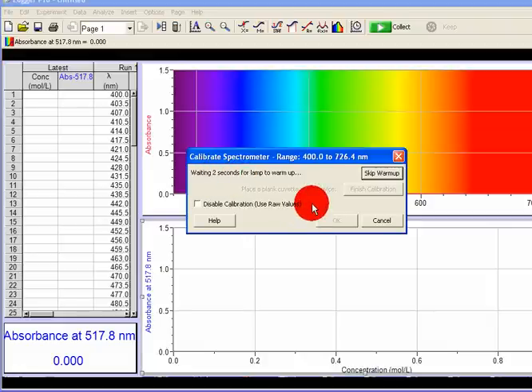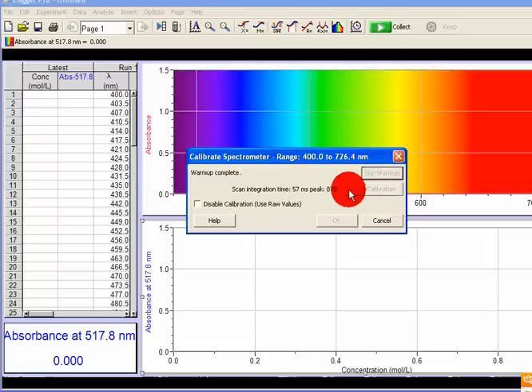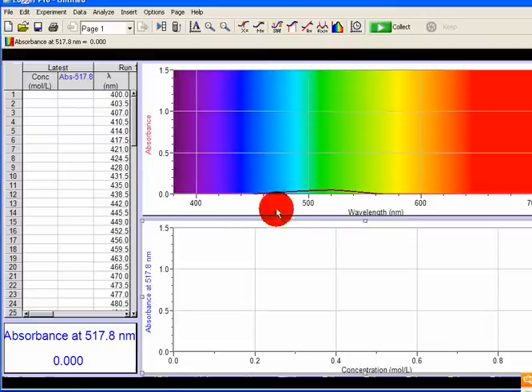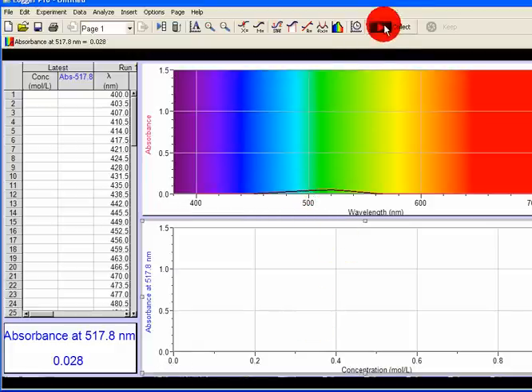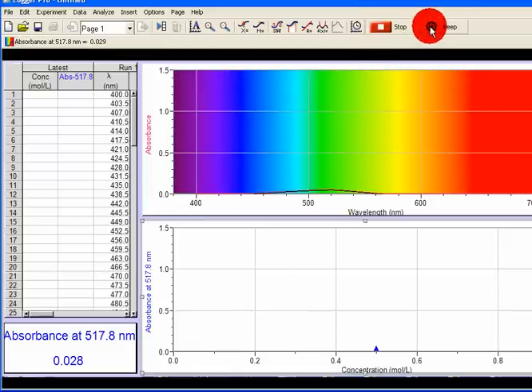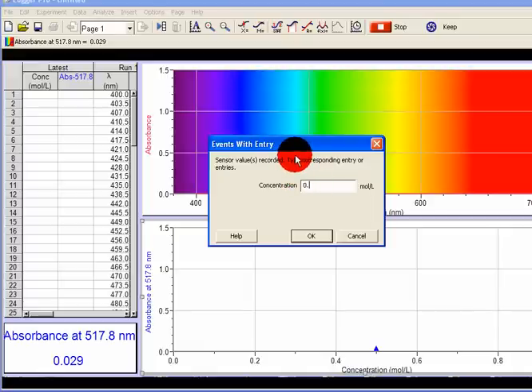So this is done. I place a blank cuvette — put it in. Click on Finish Calibration, click on Finish. It will scan. I click on OK. It has calibrated. Remove it, then put in my first cobalt chloride solution. Click on OK. I'm going to click the Keep button. I'm going to keep the concentration — this is the concentration I prepared, which is 0.0001 M cobalt chloride. Click on OK. So for this concentration I get this absorbance.